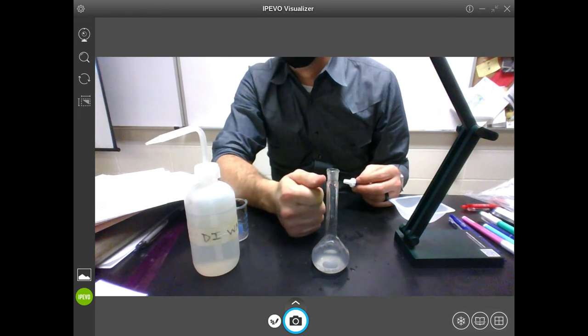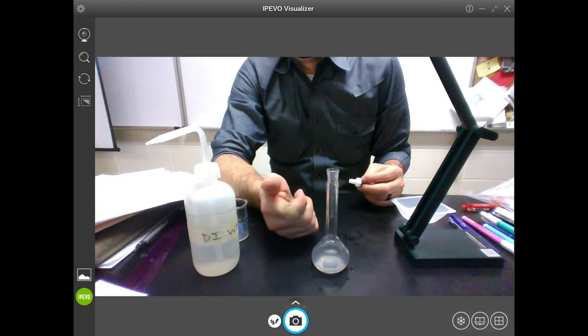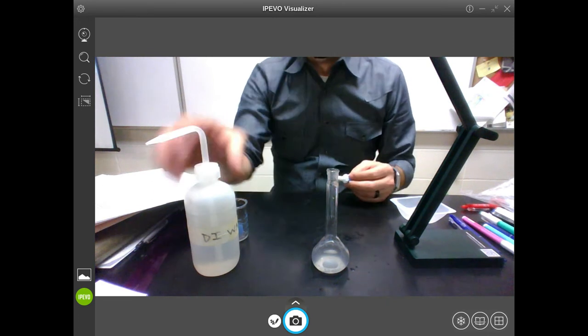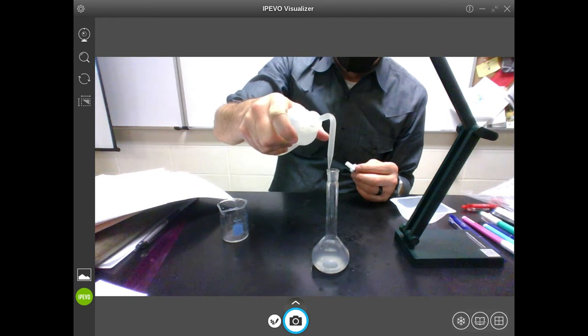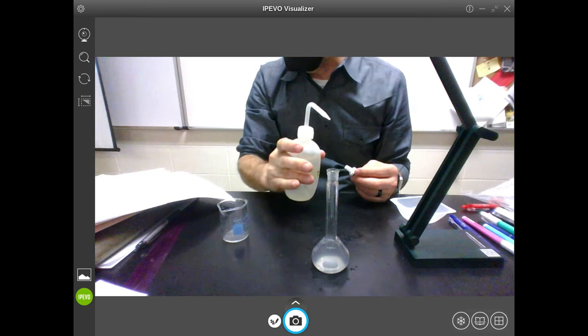You can't get it back because you've added too much liquid and the concentration is off, and there's no way you can remove liquid without removing some of the solution. So the main thing is, you cannot blow by that line. So basically what you do is you keep filling and fill and fill until you get close to that line.